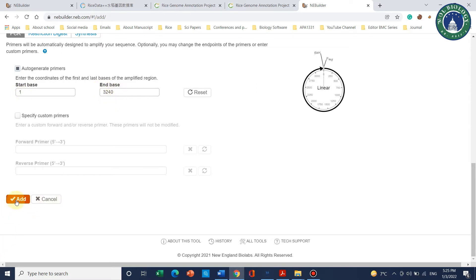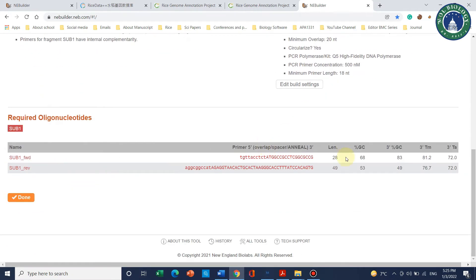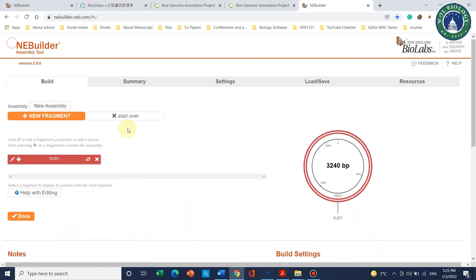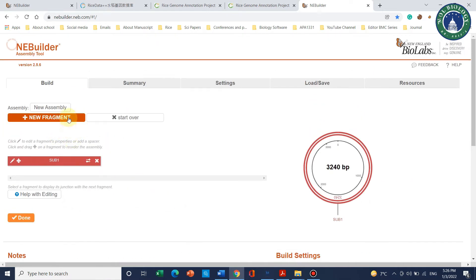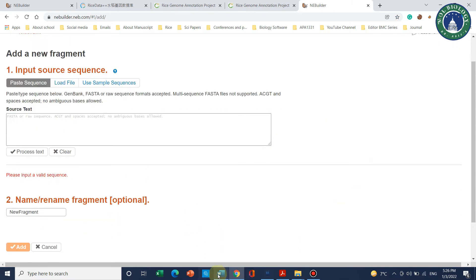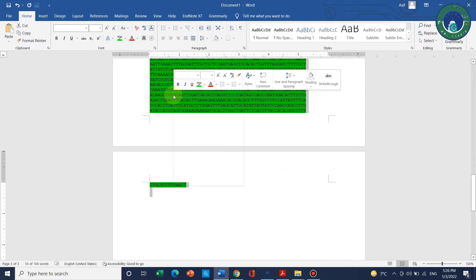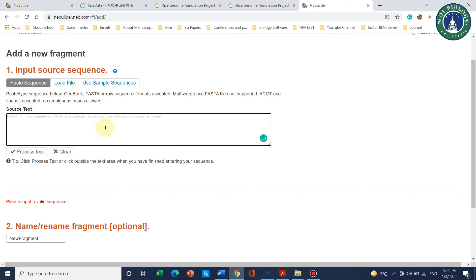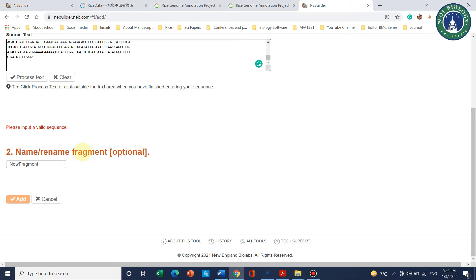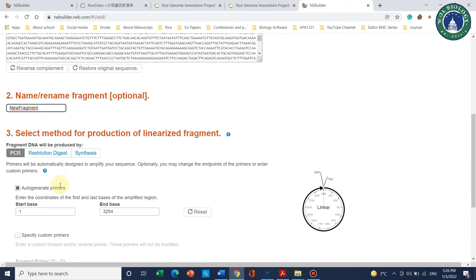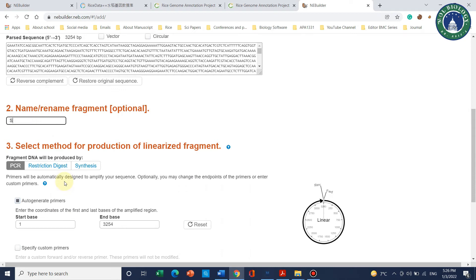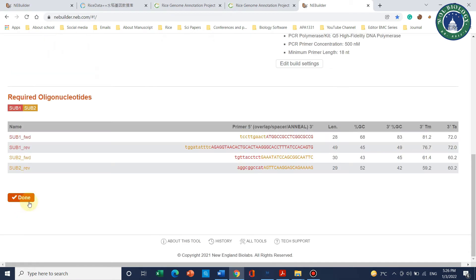Click 'Add' to add the first fragment. We can see that the forward and reverse primers for this fragment have been built by the assembly tool. Now we will add the second fragment — click 'New Fragment', copy the second part highlighted in green, go back to NEB Builder and paste the sequence. We will name this fragment 'Sub Part 2' because this is the same gene divided into two parts.